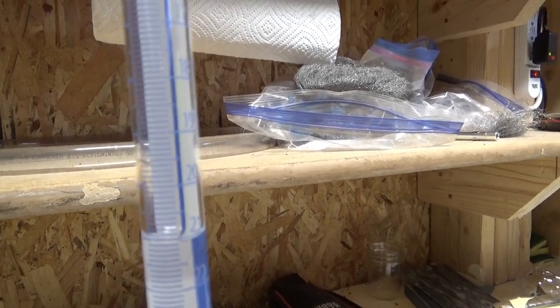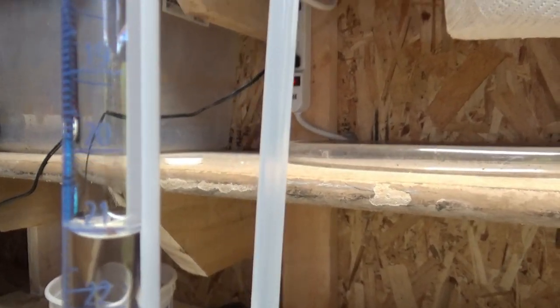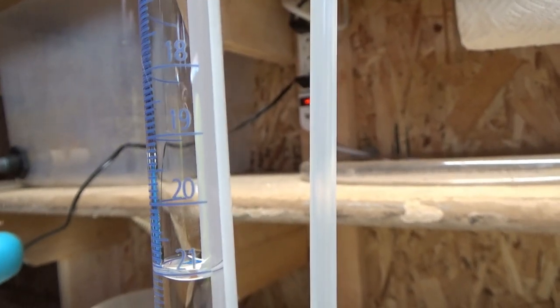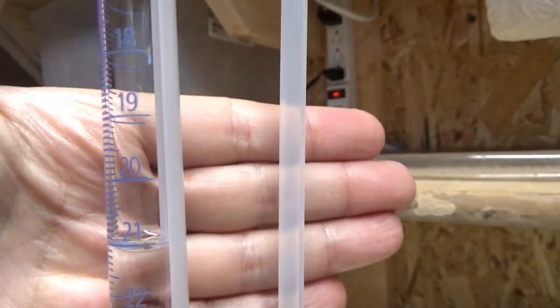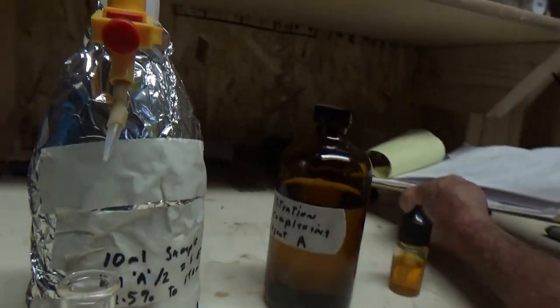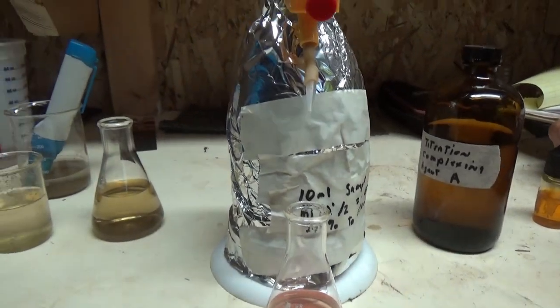According to the instructions, if the complexing agent A consumption is 4.8 milliliters, then the Eco Gold X agent concentration in solution equals 4.8 divided by 2 equals 2.4%. Well, I put 1 gram, I hope it was 1 gram. Yeah, it's set to grams. I put 1 gram of chemical in 100 milliliters of water.